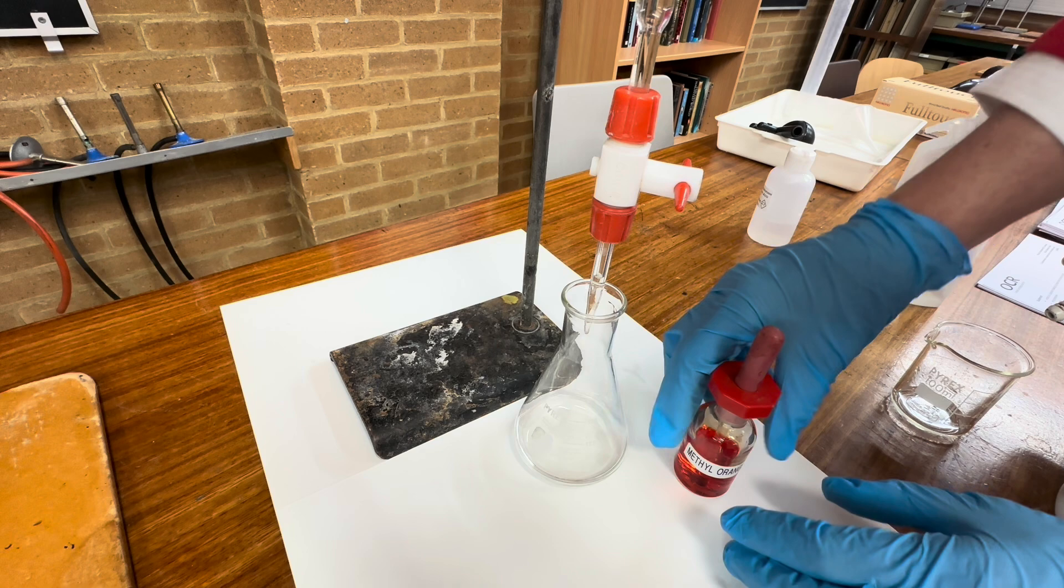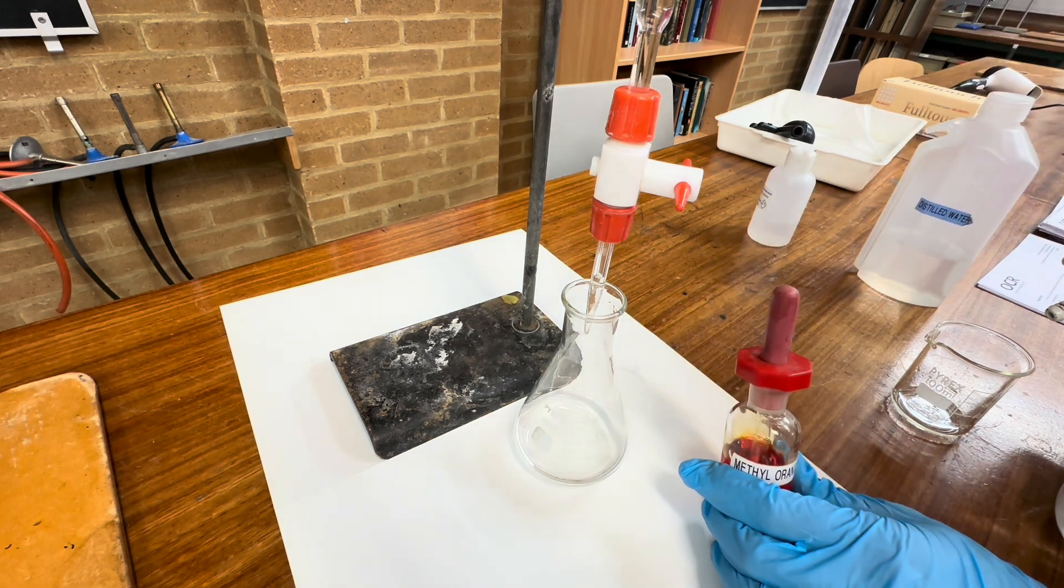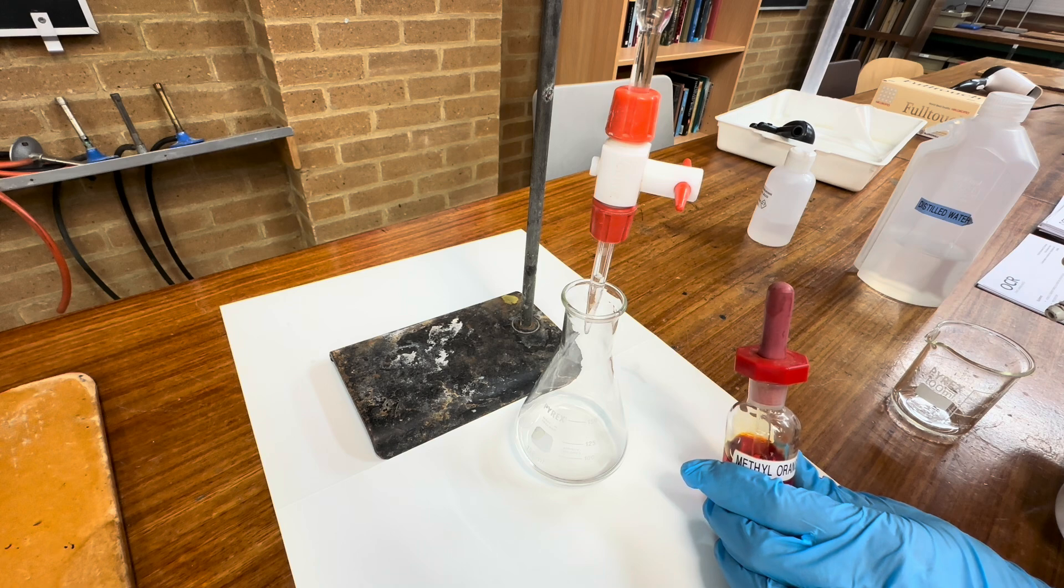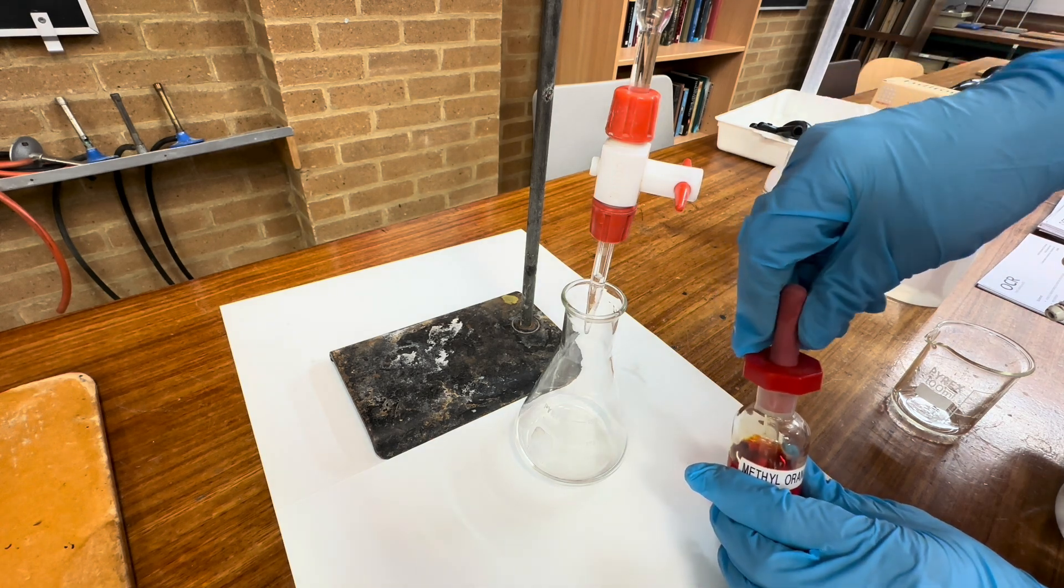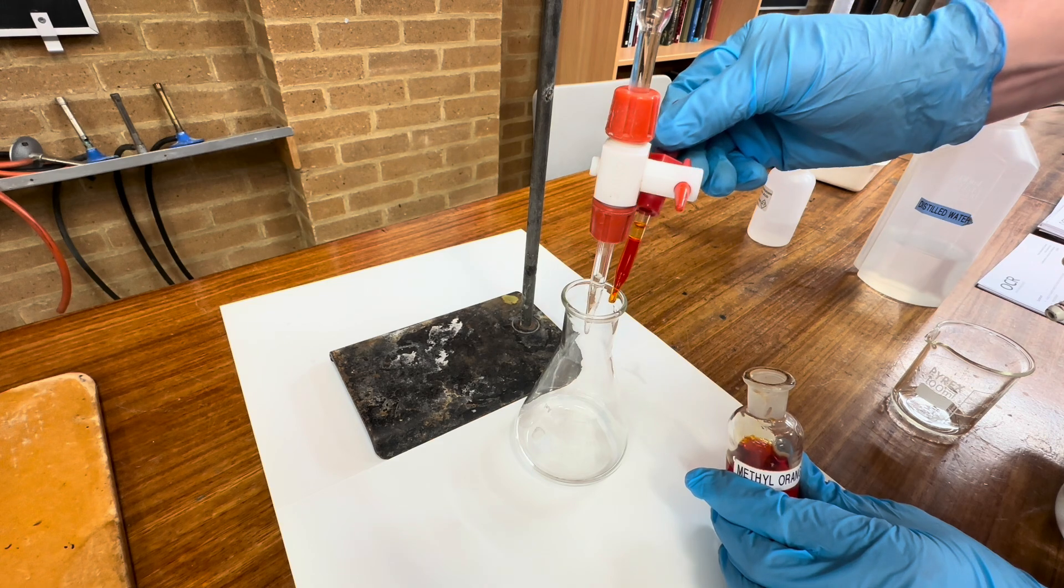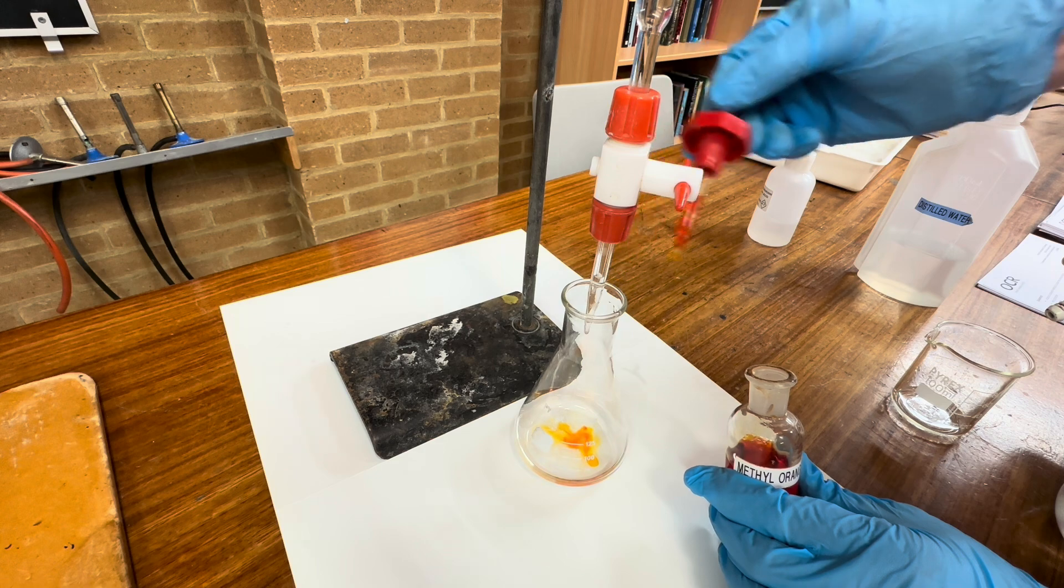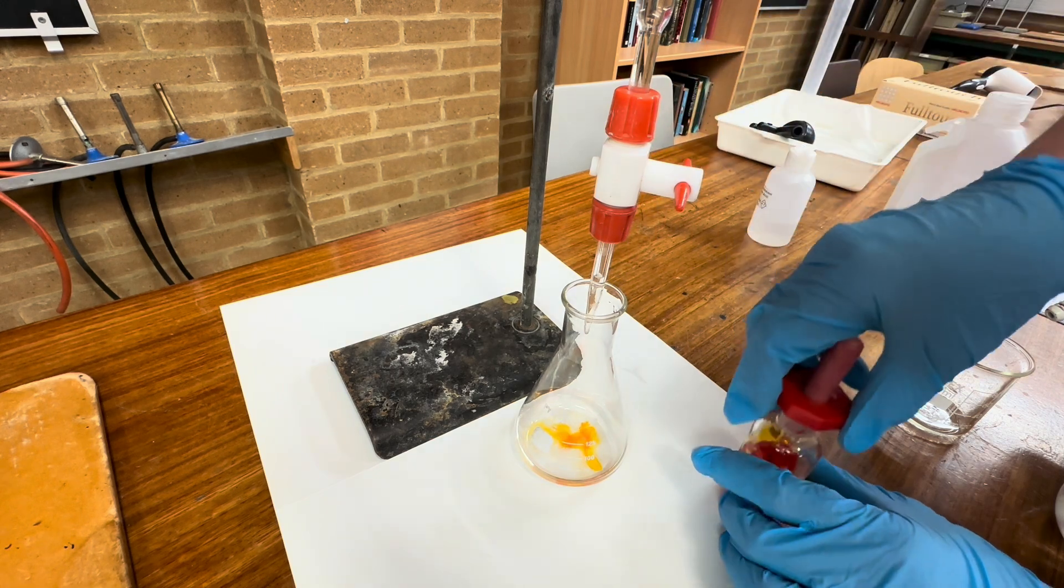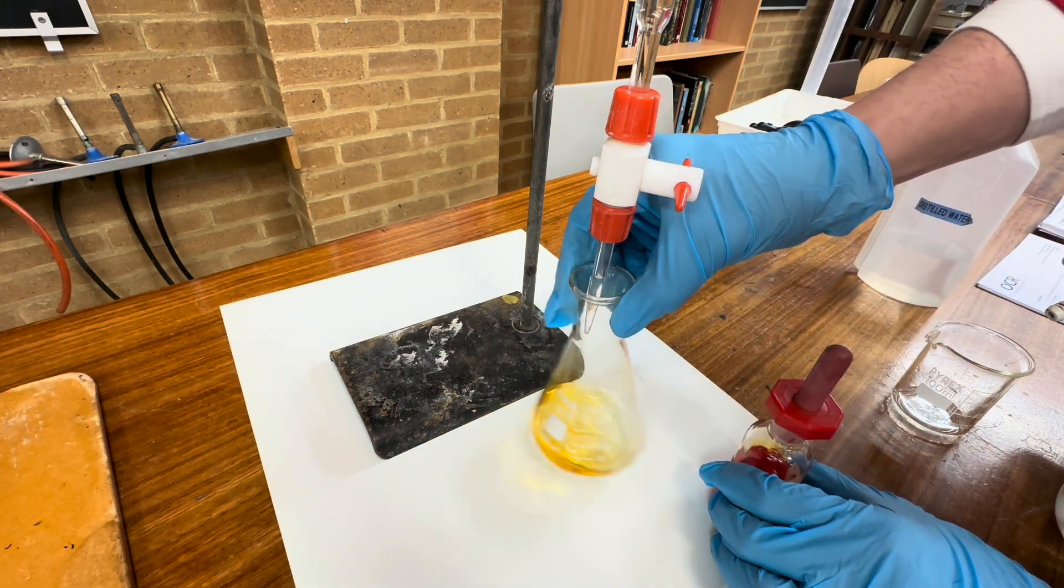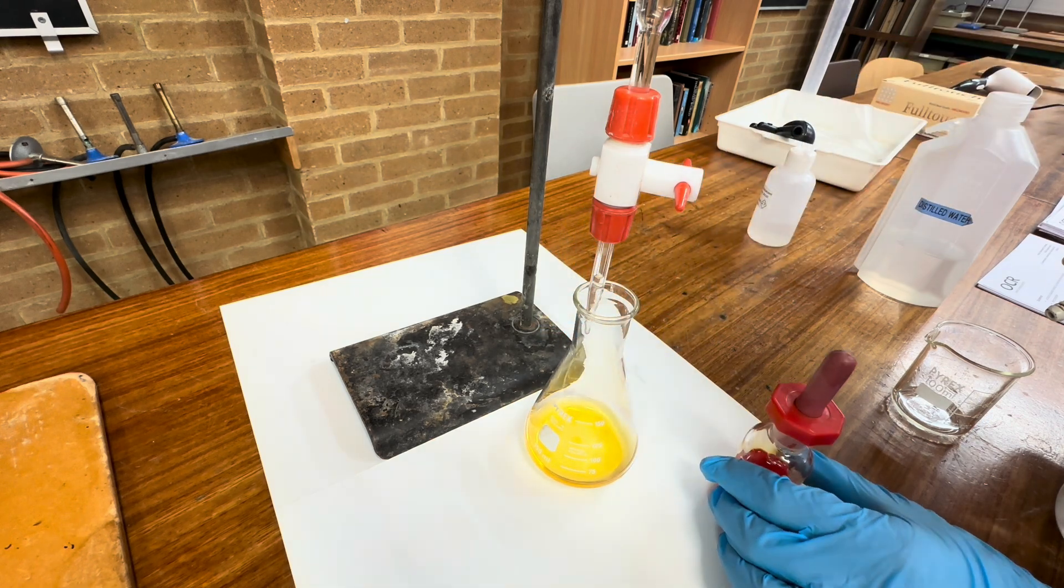We must add the indicator, in this case methyl orange. Methyl orange will go from yellow to orange when the end point is reached. So we take a few drops of this and add. There we go. And throughout we're going to swirl so that we get a nice observable color change.